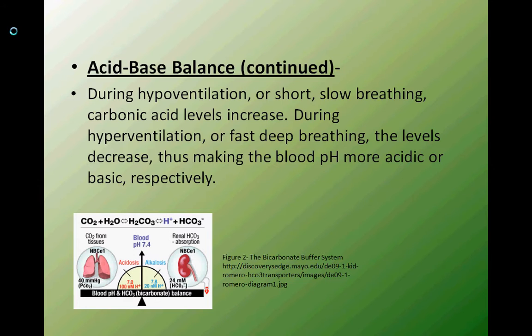Figure 2, in the bottom left-hand corner of the slide, is a diagram that shows the actual chemical reactions that happen to release the hydrogen ions and the CO2.